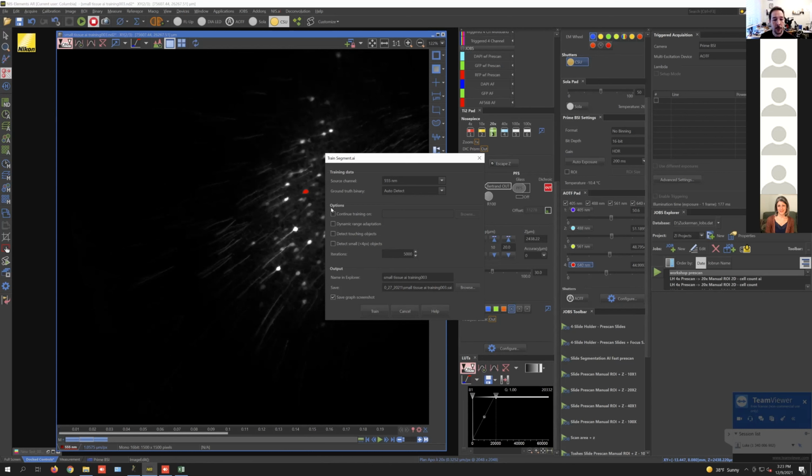And if you have a network that's working well, coming back to your question, say it's working well for a bunch of neurons, but you've got a new label that's slightly different and it's not working quite as well, but it's pretty close, you can label a new set of images with this new label, and then load, say, continue training on the previous network. So you've got a network that works well, it's not working so well for these new cells, mask up some of these new cells, and then do some additional training, maybe just an extra hour or so of the network processing these new images, and that will make it adapt to those neurons as well.